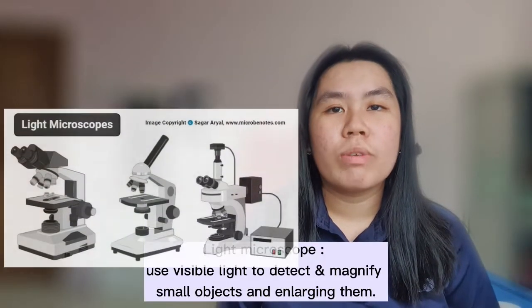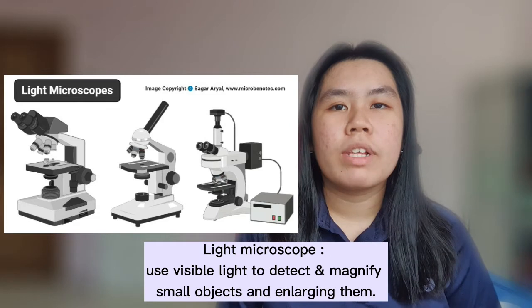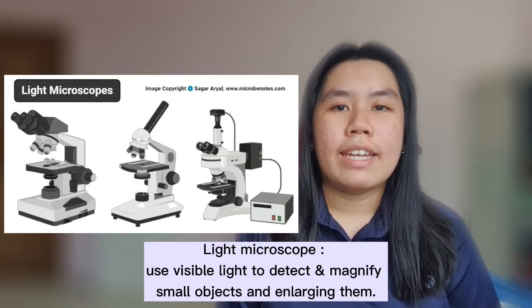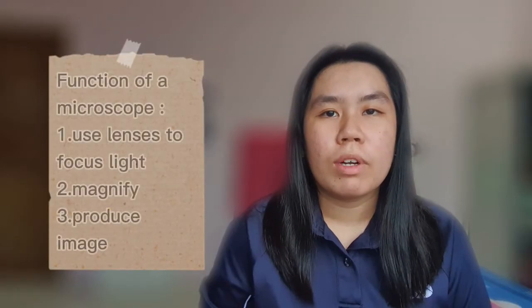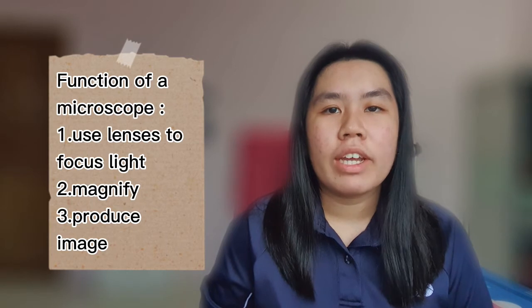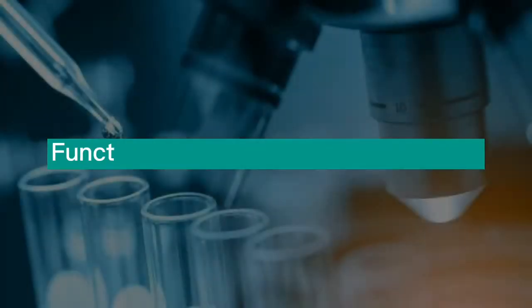A light microscope is a biology laboratory instrument or tool that uses visible light to detect and magnify small objects and enlarging them. Function of a microscope is they use lenses to focus light onto the specimen, magnifying it, thus producing an image. The specimen is normally placed close to the microscopic lens.